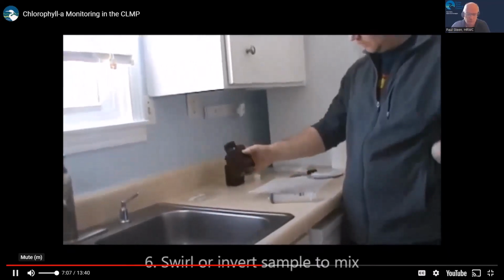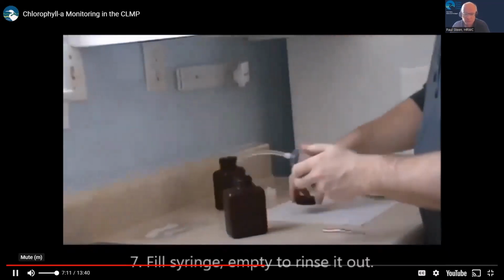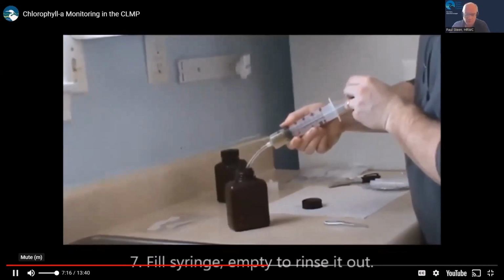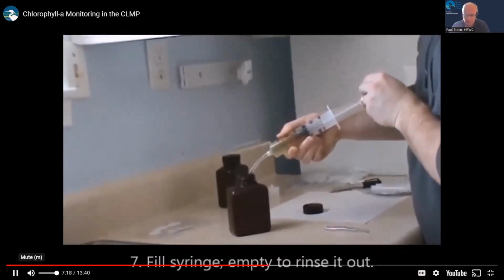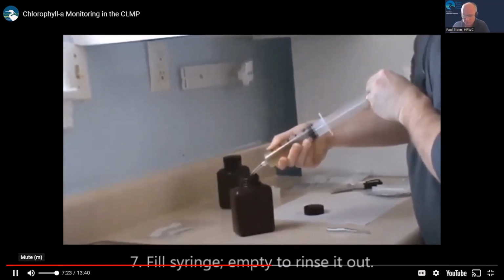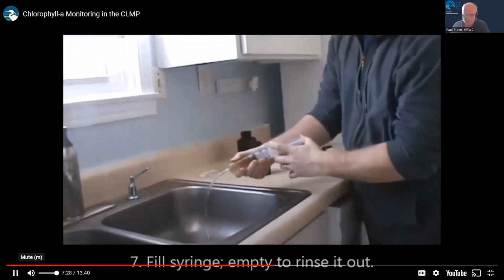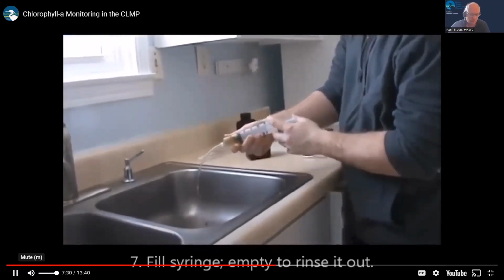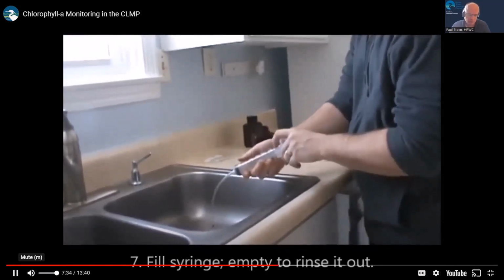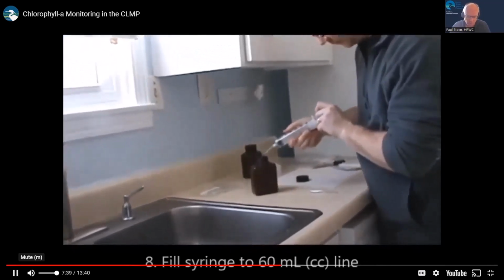Swirl or invert one of the amber bottles to mix. Rinse the syringe by drawing up sample water until the syringe is full, and then empty it. Then, fill it up to the 60 milliliter line.